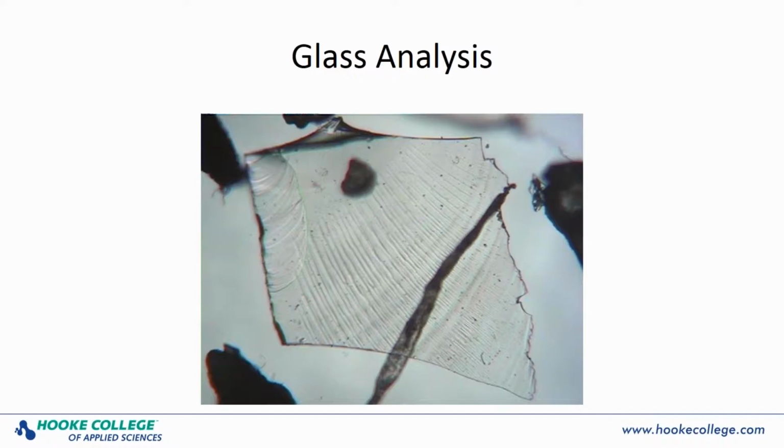Borosilicate glass, like cookware or laboratory glassware, has a low index due to the boron, while leaded crystal has a very high index. Window glass and bottle glass fall somewhere in between. The refractive index, along with the dispersion of the index, measured at various wavelengths of light and at various temperatures, can be used to either include or exclude a piece of glass from a particular source.